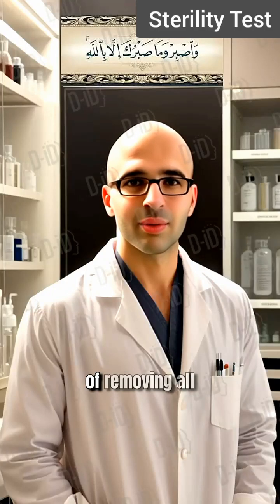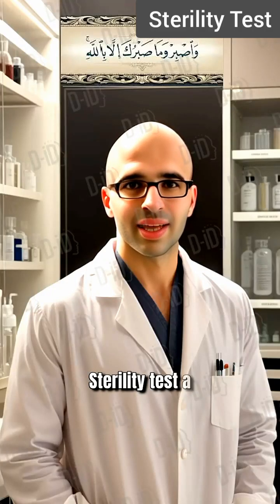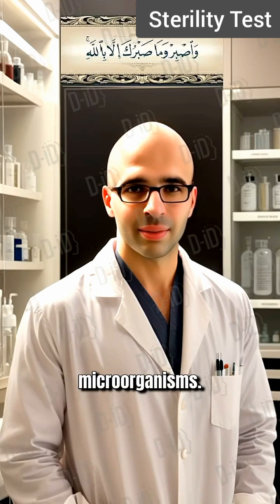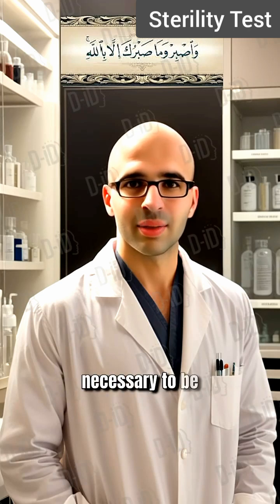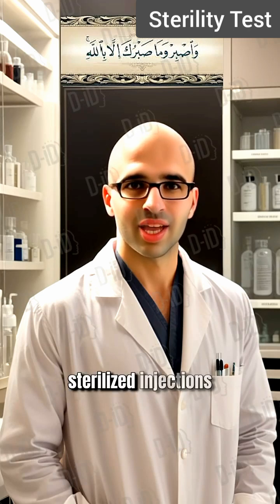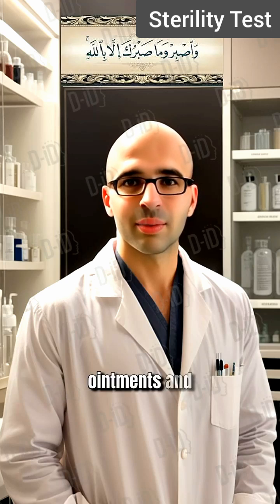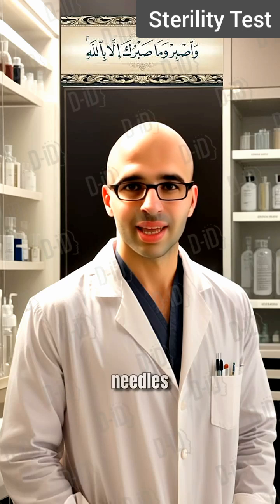Sterility, process of removing all viable forms of microorganisms. Sterility test, a test that critically assesses whether a sterilized pharmaceutical product is free from contaminating microorganisms. Products which are necessary to be sterilized: injections, implants, syringes, ophthalmic preparations, ointments and creams.